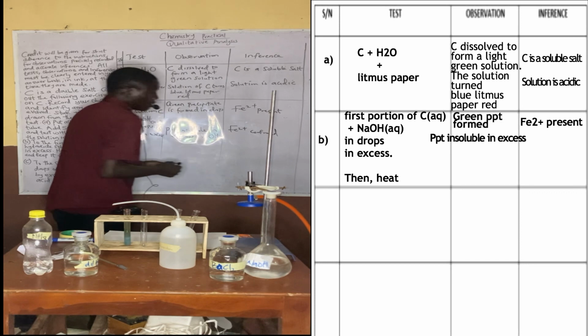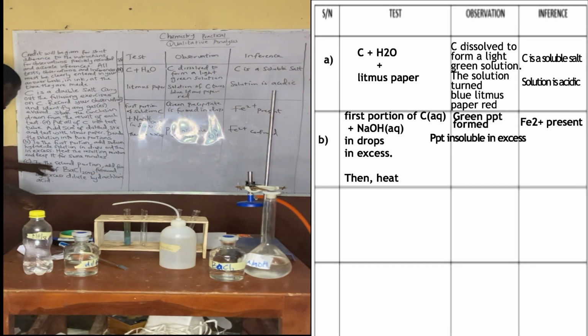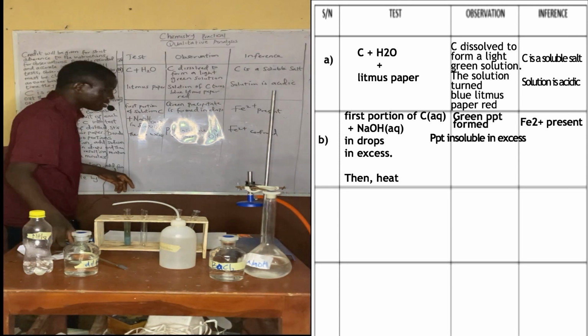Now, we are asked to keep the resulting mixture for some minutes. Now let's heat the mixture.